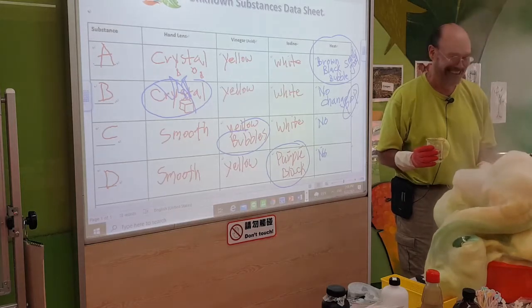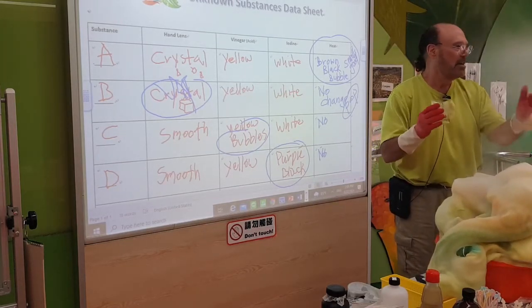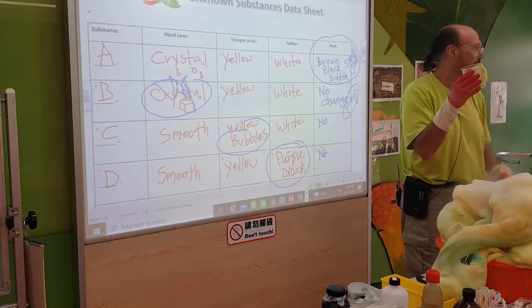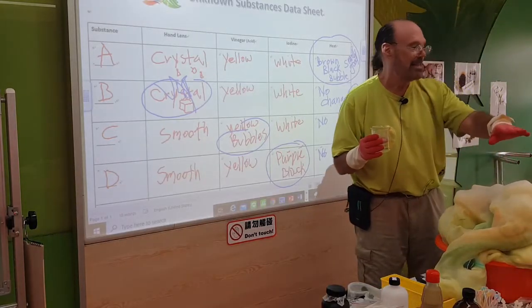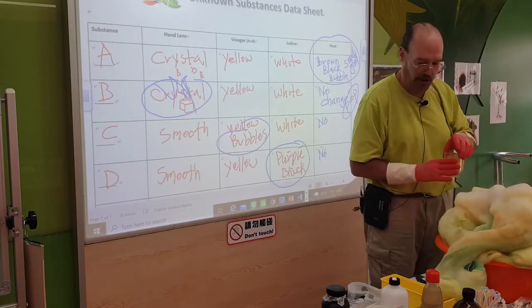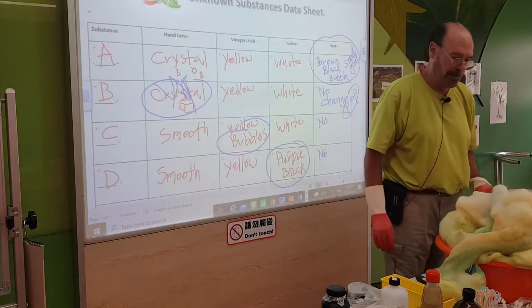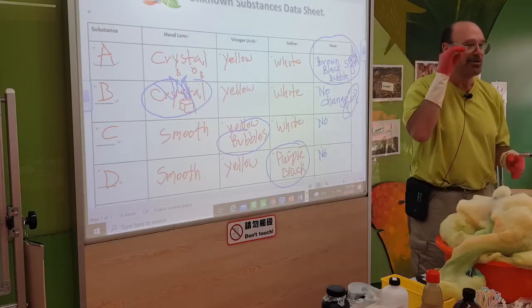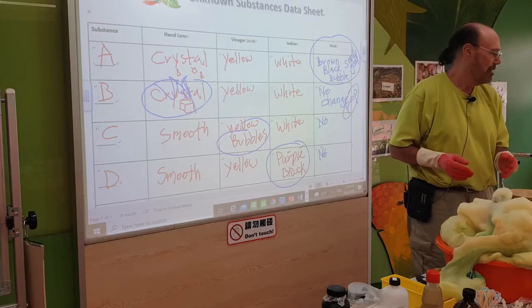I guess it works. So that's just hot, soapy water because the one oxygen has left very fast, and this is a catalyst that helped it go fast. The only danger is that it gets hot. It's very hot. So, we call this experiment elephant toothpaste. It's a very popular science chemical reaction deal.